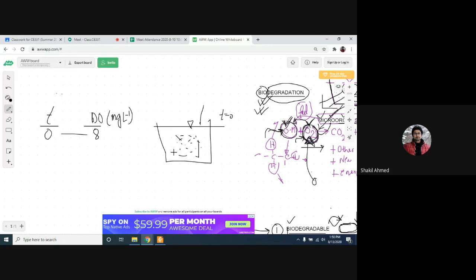What would happen? Now microorganisms will degrade, will eat them, and will consume the oxygen from water. That means after 1 hour, for example, you will see your DO will reduce, maybe to 7.